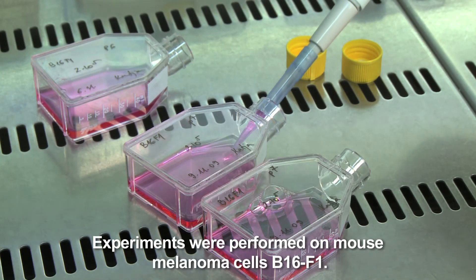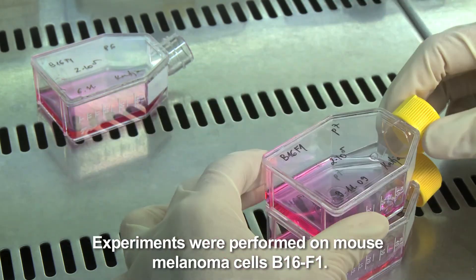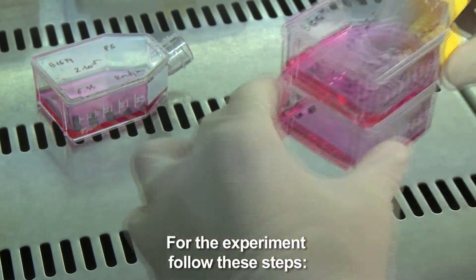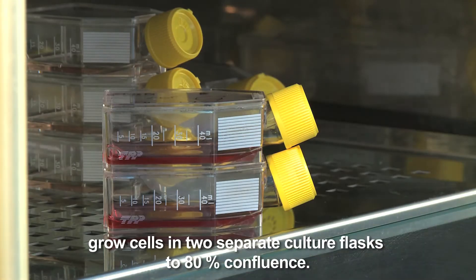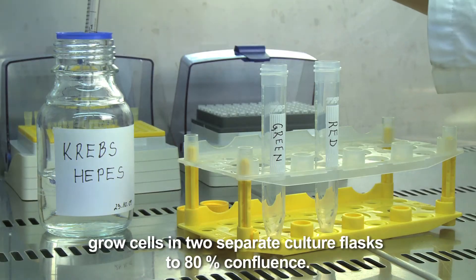Experiments were performed on mouse melanoma cells B16F1. For the experiment, follow these steps. Grow cells in two separate culture flasks to 80% confluence.